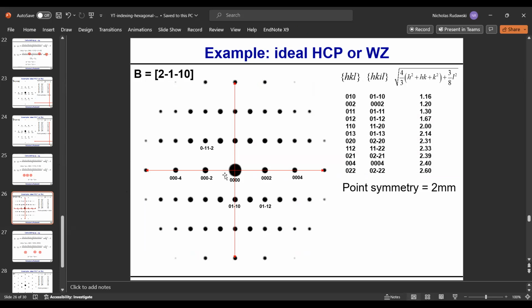Does it work out with the math? Yes, the math works. All right, so let's go ahead here. We'll do some more of these spots. Okay, put this one back.